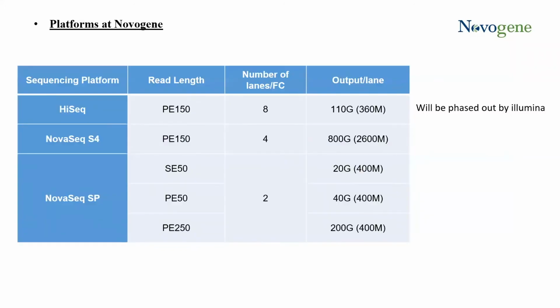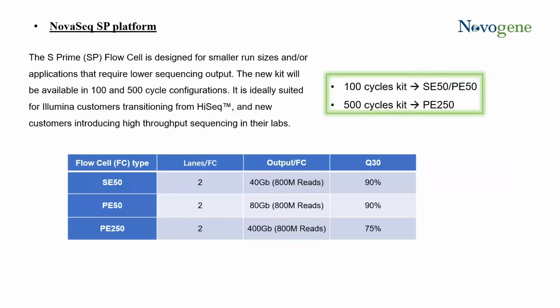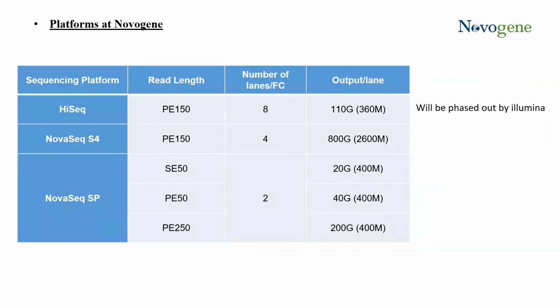All right, so we've gone through essentially everything up until the point of loading the samples on the machine. And so this is where it's important to understand the differences, to understand your data needs, and to understand the potential need for a different sequencing approach.